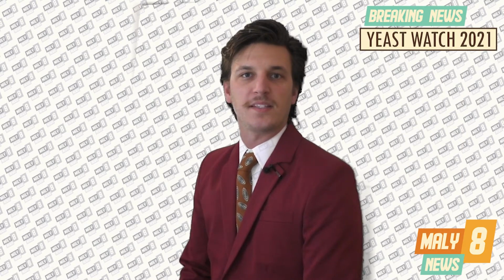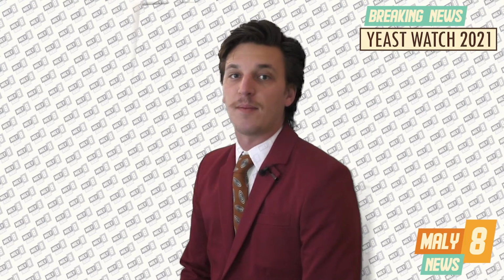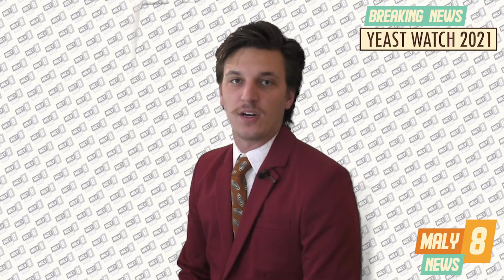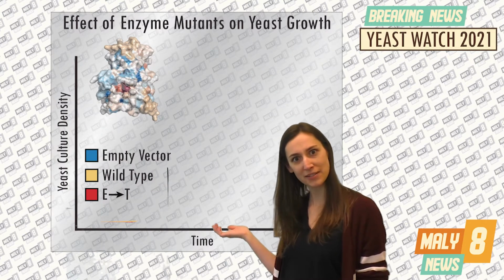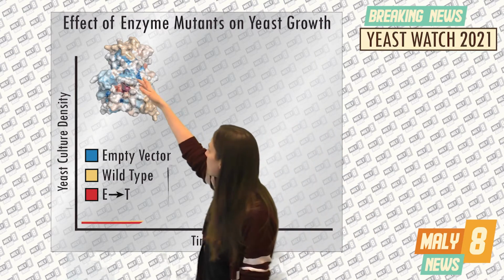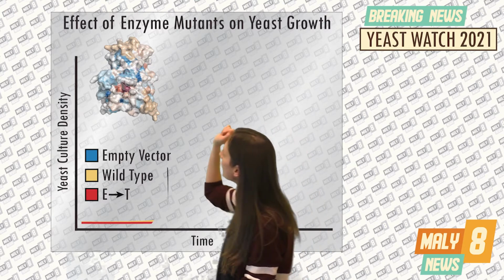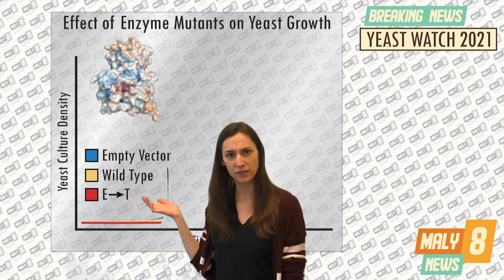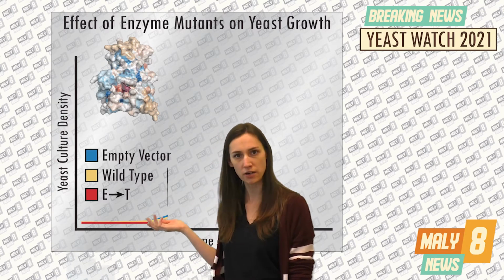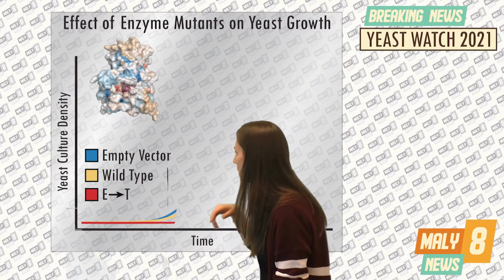Ooh, you know what that sound means. The deep mutational scanning data is in, and it's time to check in with Jessica. For more, this is Yeast Watch 2021. Hey, not Ron. Our DMS results are just in. Up here, what we're seeing, as expected, most of them are loss of function, but there are a couple right around here that surprisingly are gain of function. Could this be an unknown regulatory mechanism? Let's look at the individual curves and find out.